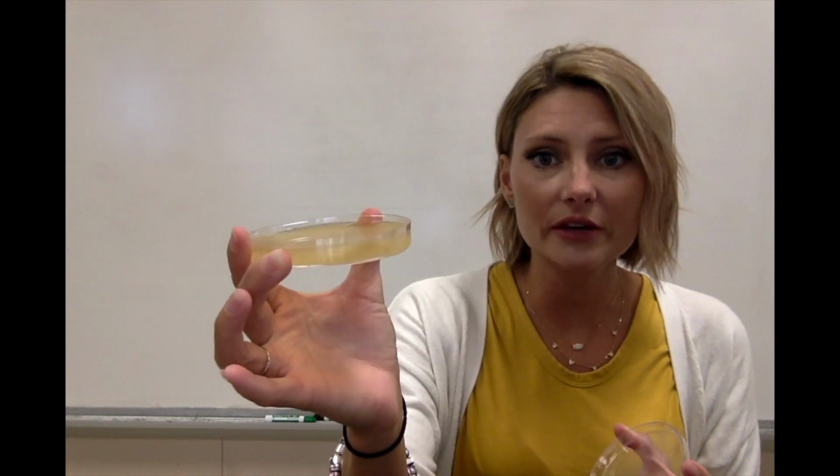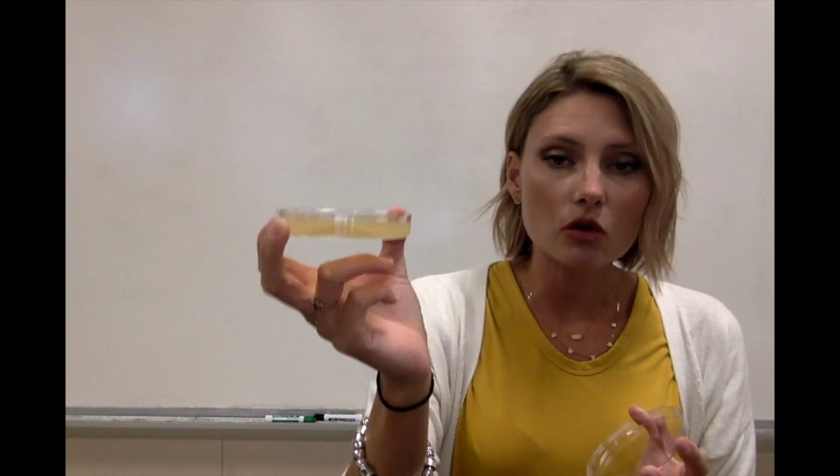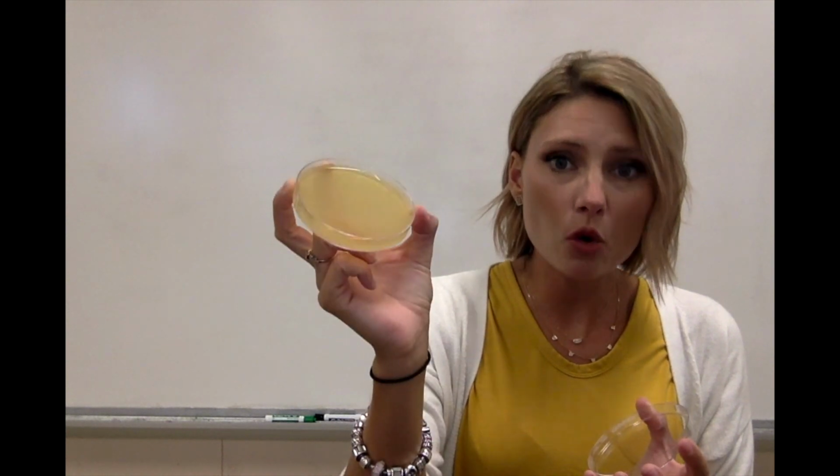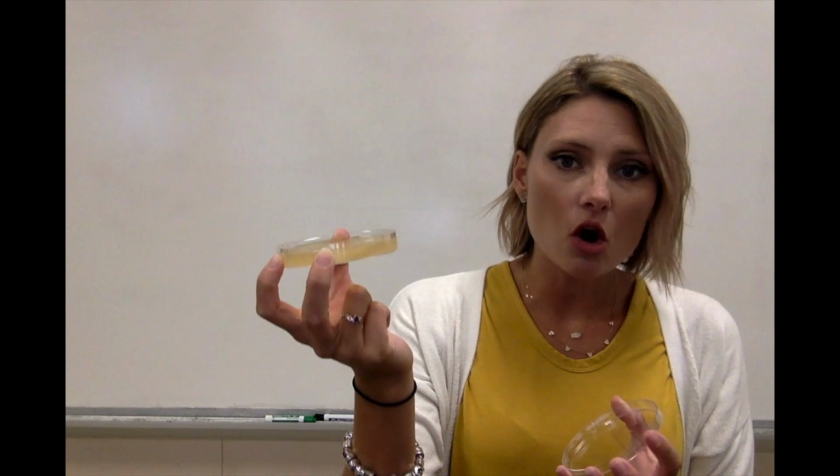The bottom is where the media is at. And I actually have media in here. Okay? And so that yellowy stuff is the media. And so I boiled it, autoclaved it, let it cool, and then I poured it into this Petri dish while it was still liquid. And then I let it harden, and so it basically has the consistency of a hard Jell-O. And so that's a Petri dish.